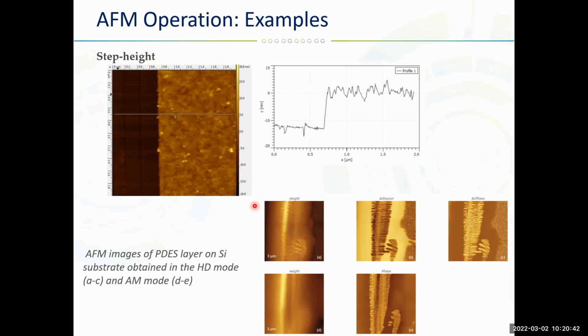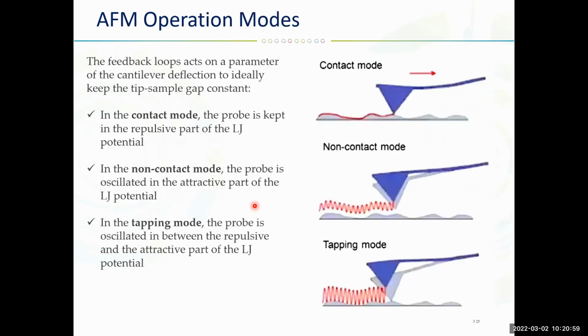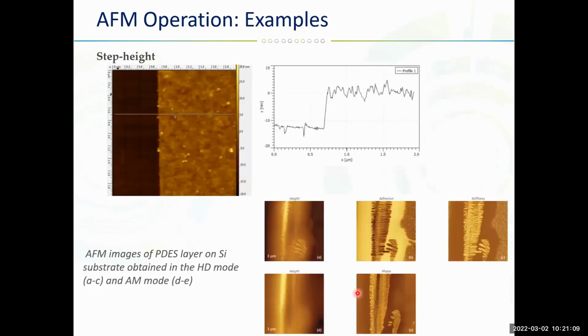In this mode, the sample and the probe interact at a frequency below the resonant frequencies, and the probe deflection level is more directly related to the tip-sample forces, because here we also check the deflection. But because of the vertical movement, it sometimes is not a linear correlation.